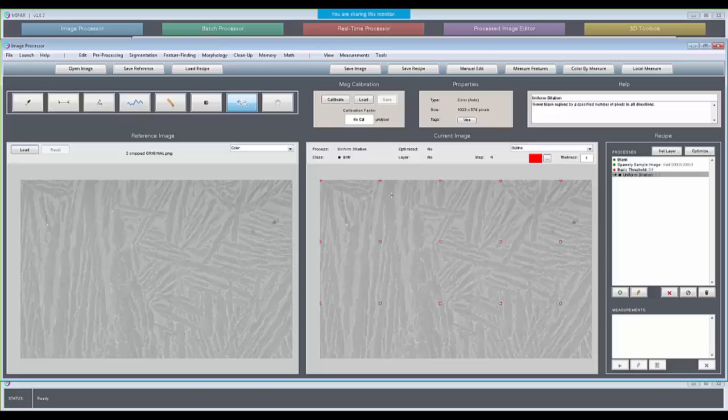And some folks still prefer to take one image and point count in the segmentation with 100 points, and then repeat that random point count on the image 100 times, and say the uncertainty of their area fraction is the spread that they get from those 100 measurements of the same image. If that's the approach that you want to take, then that's certainly okay. We're here to facilitate the different research approaches that you want to take. So what you can do is set up these point grids to do that kind of analysis. So I can quickly demo that here.